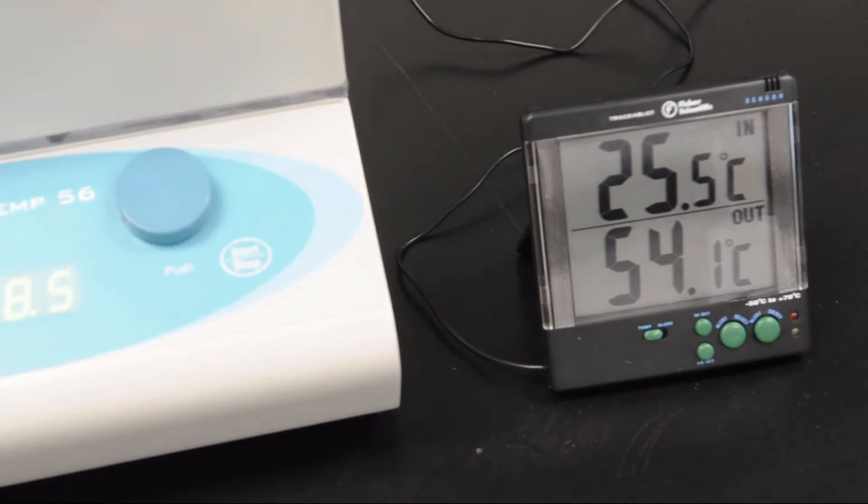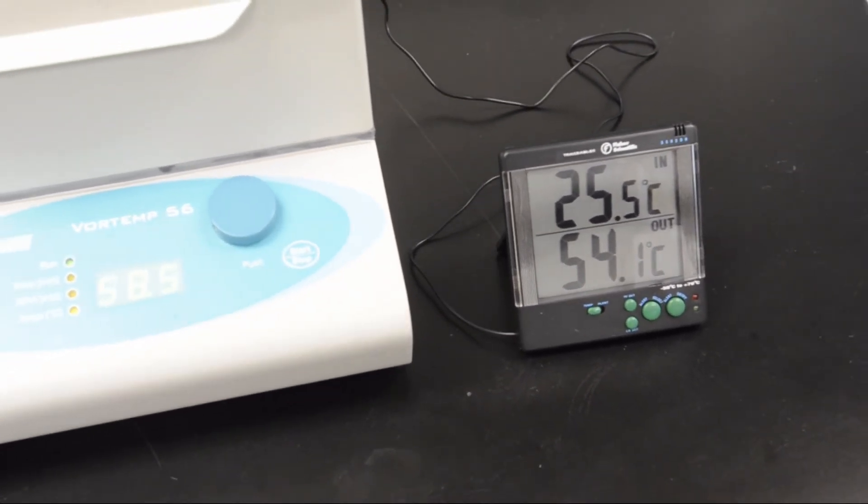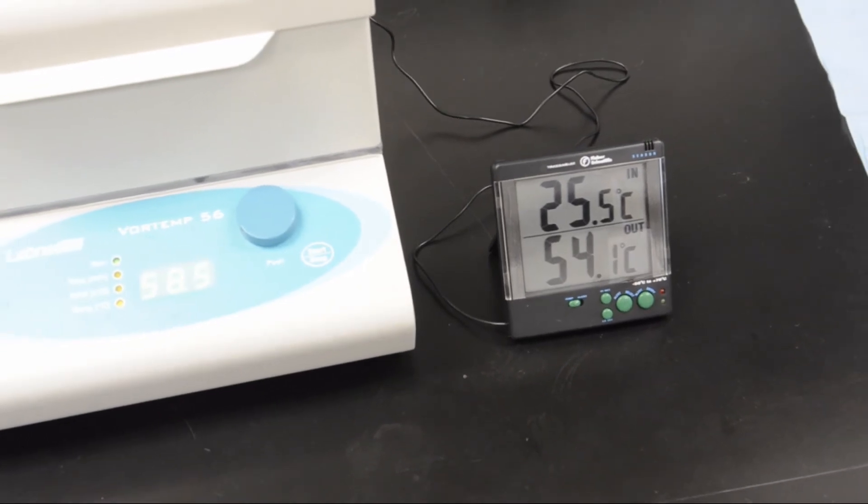The temperature displayed on the Vortemp unit and the temperature measured by the digital temperature meter can vary as much as 4 degrees.